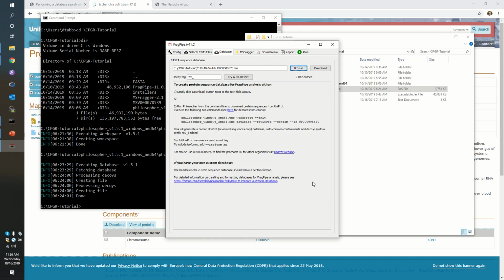I would just point out that FASTA files can be a little idiosyncratic, that some people will call them whatever.fasta. Some people will call them whatever.fa, like Ensembl does. Some people will call them FNA if they're nucleotide sequences, and other people will use FAA for amino acid sequences.